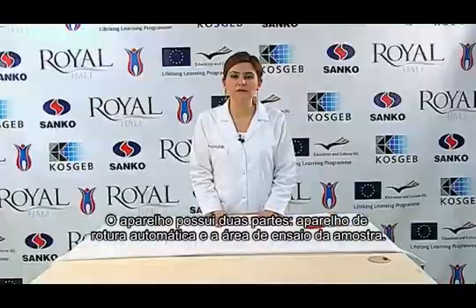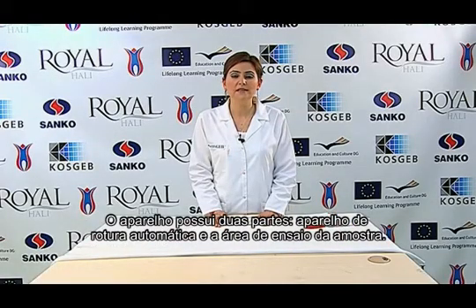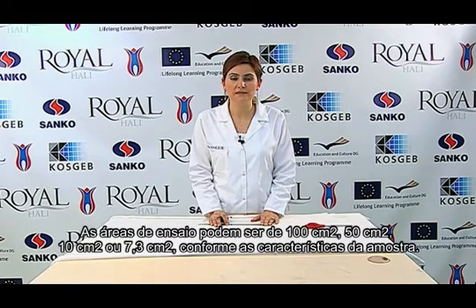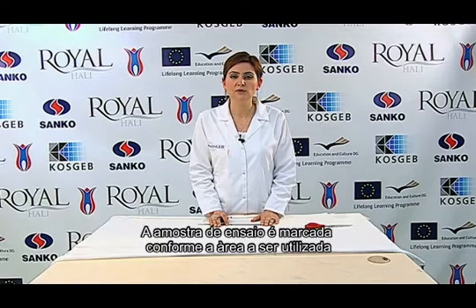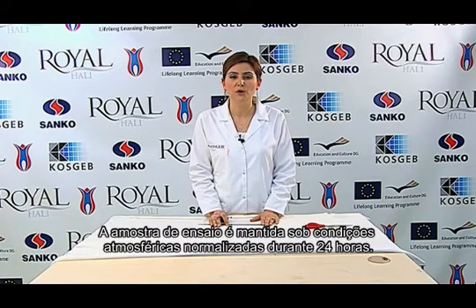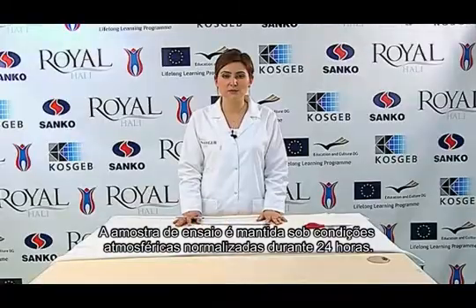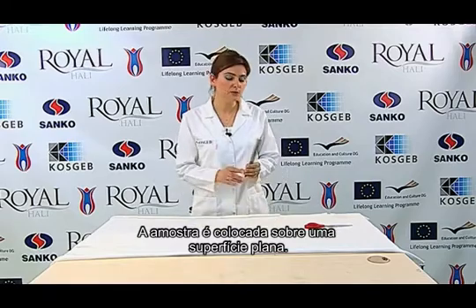The device is comprised of two parts, which are the automatic bursting device and the sample test area. Test areas can be 100 square centimeters, 50 square centimeters, 10 square centimeters, or 7.3 square centimeters, according to the characteristics of the sample. The test sample is marked according to the area we will use. We condition the test sample under standard atmospheric conditions for 24 hours. We lay the conditioned sample on a flat surface.